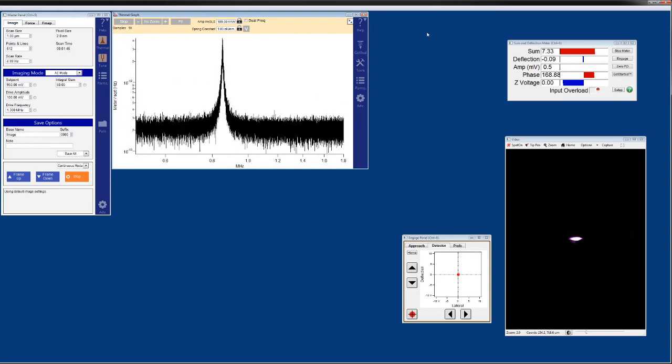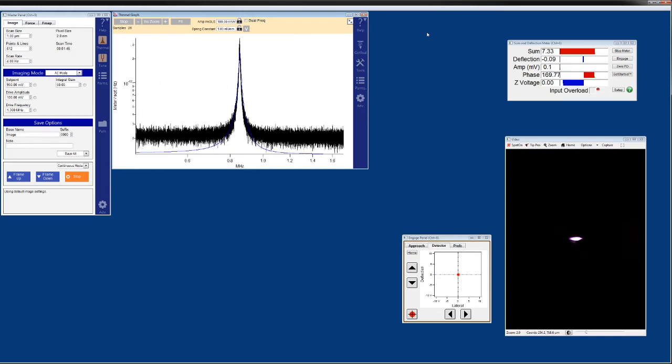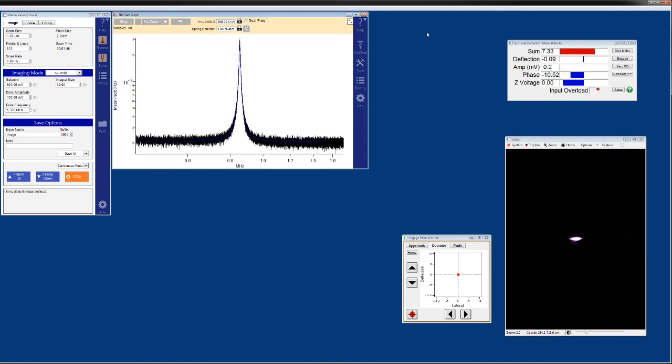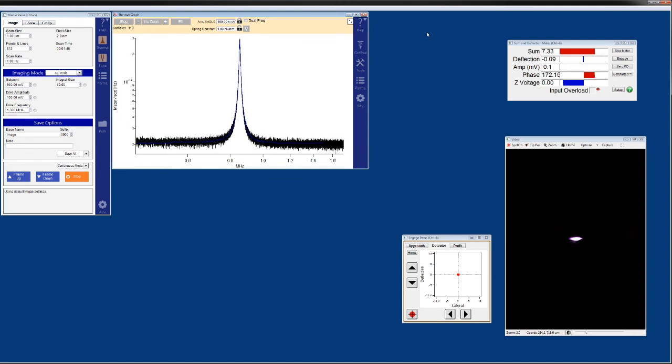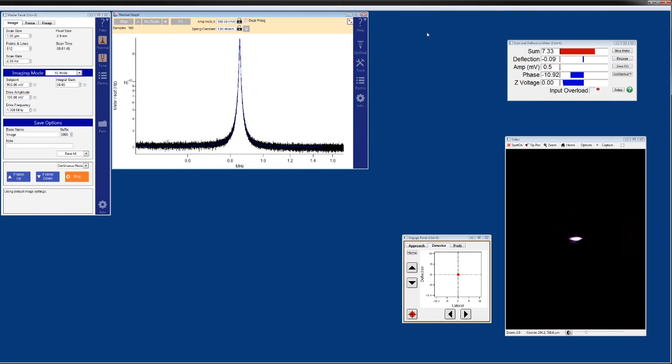During this calibration that will take less than 30 seconds, the tip will never have to touch the surface as it is the case in conventional methods using force curves. So there is no risk to damage or contaminate your tip and there is no need to switch to hard sample for the calibration prior to imaging your sample of interest.